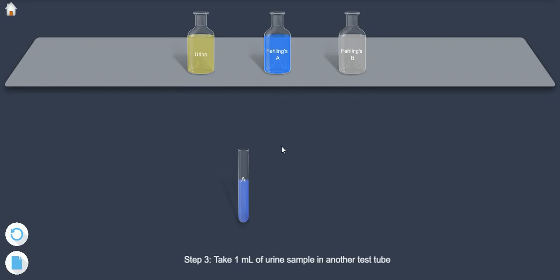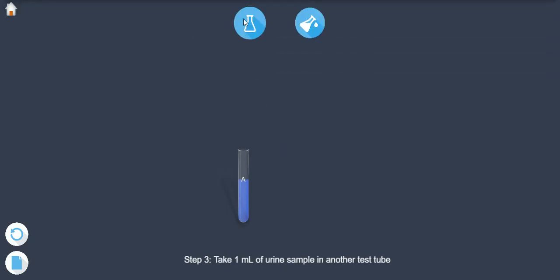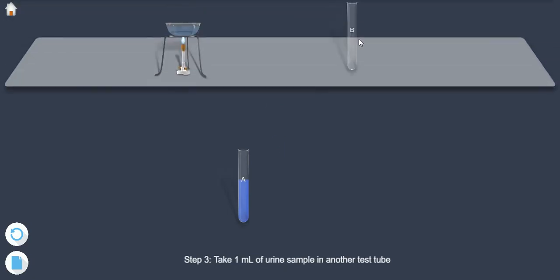Step 3: Take 1 ml of urine sample in another test tube.